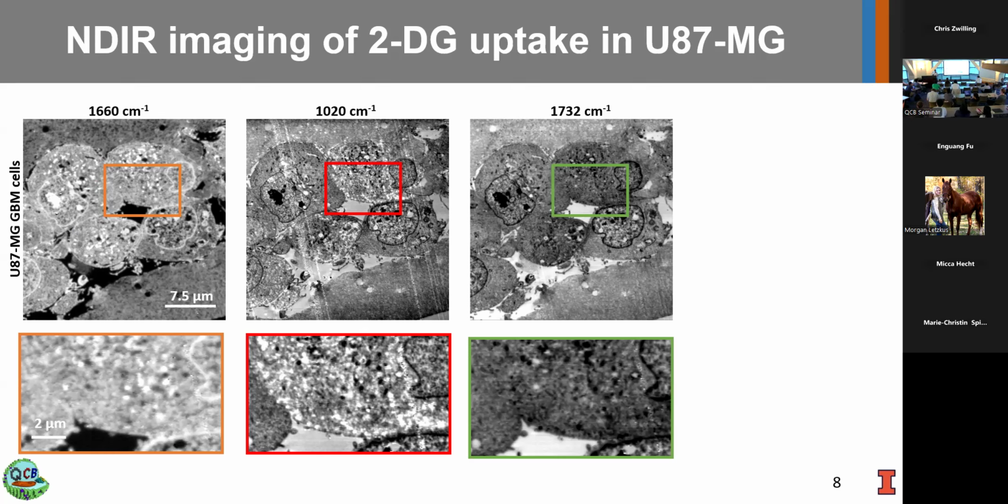And what about the metabolites or the other things? Yes, that's something to be figured out, because when I use that protocol, it's for sure that not all metabolites are going to be preserved. For example, the ethanol I use will dissolve most of the lipids, so for sure we cannot see any of the lipids in this case. But glucose does not go away, which is why in this protocol right now glucose can be tracked till the last step.